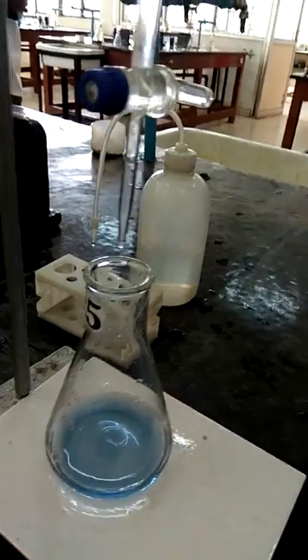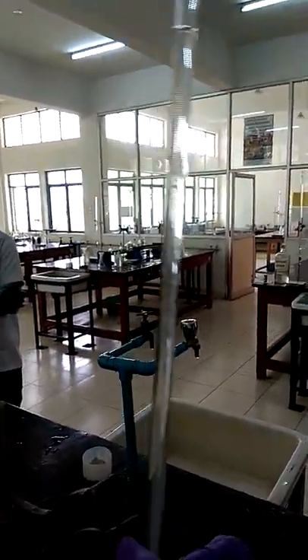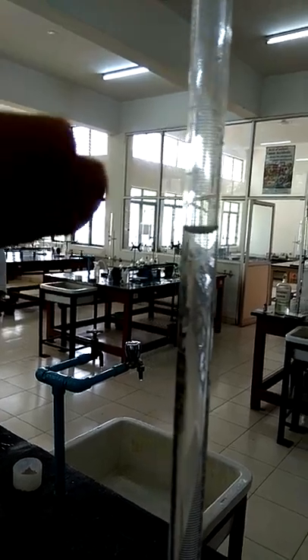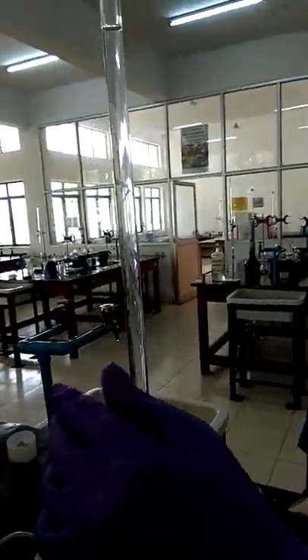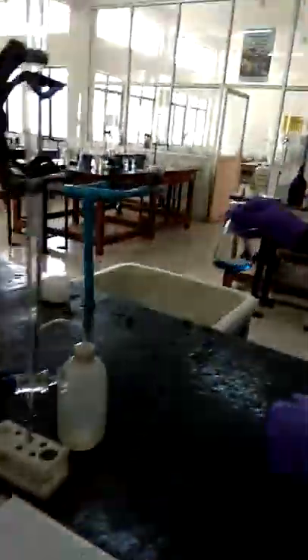Then you take out the burette and see the reading. Keep that mark at your eye level and then see the reading. Note down the reading and get it signed. Like that, you have to repeat two more trials. Before the next trial, you should clean this conical flask with tap water and distilled water.